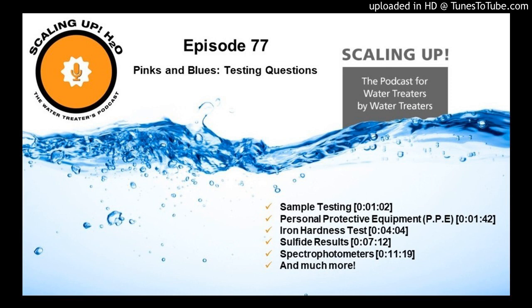Now, here are a couple of questions now that I've gotten off of my Scaling Up H2O soapbox that people have written in. So my first question is from an earlier episode, and the person is asking about when iron interferes with a hardness test. And I'm sure we've all had this issue happen. We just can't get an endpoint on our hardness tests. So on an earlier show, I shared a tip that somebody shared with me, and they were asking me to go back through that. So, fine, I will do that.